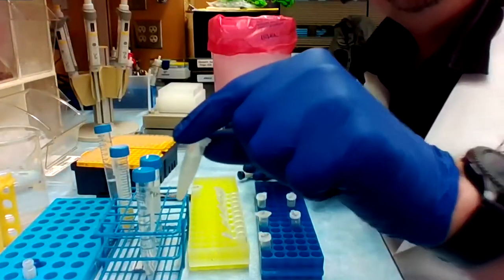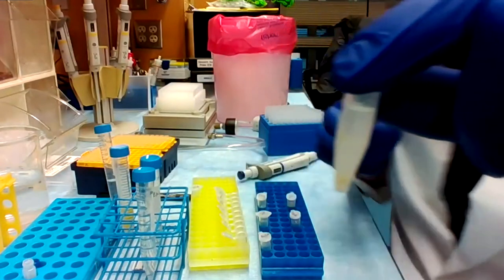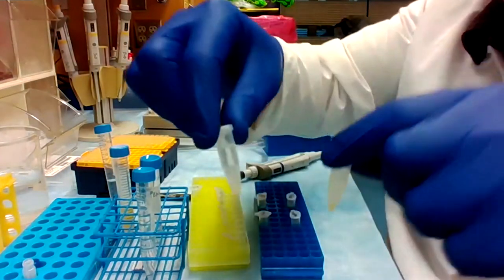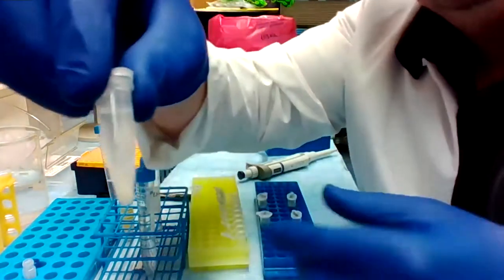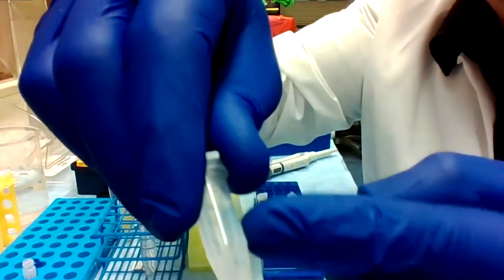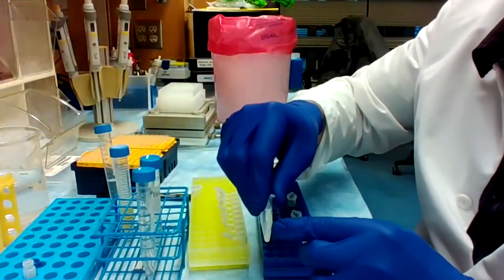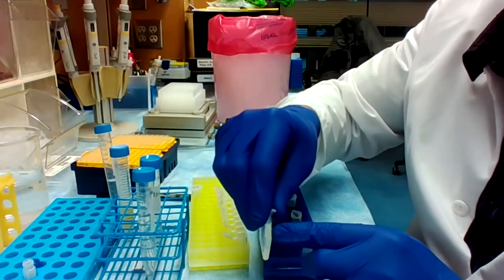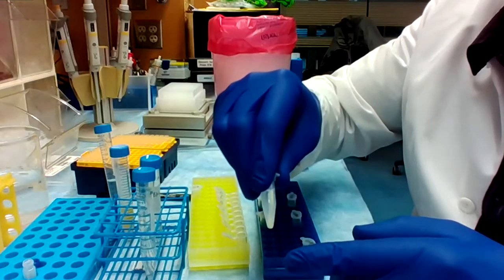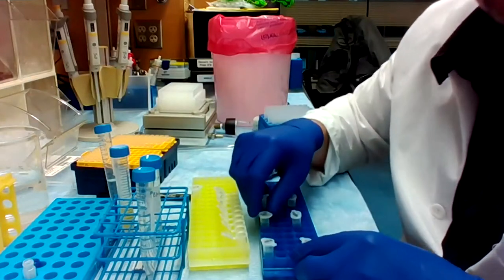With the acetonitrile, it acts to precipitate the proteins where they come down to the bottom. After vortexing and centrifuging it, it turns out like this — you can see it's one phase here. You can simply take the supernatant and either inject that into the mass spectrometer, or if you have to concentrate the sample, you can blow it down in an Enivap and then resuspend it. That makes a more concentrated sample.